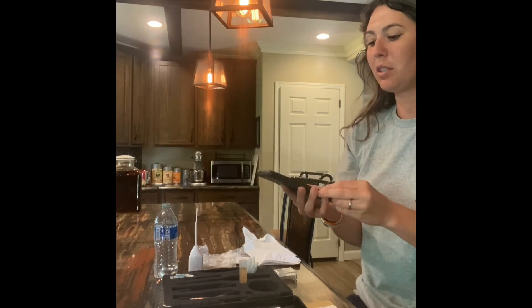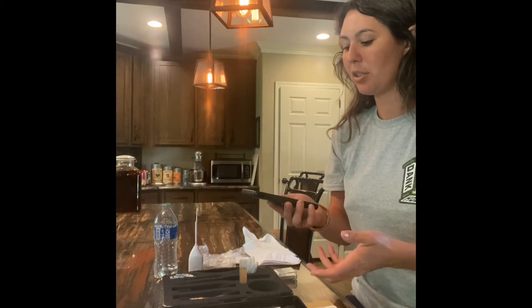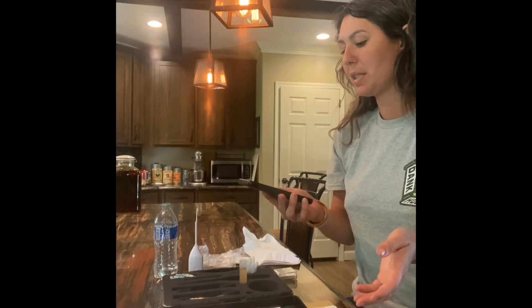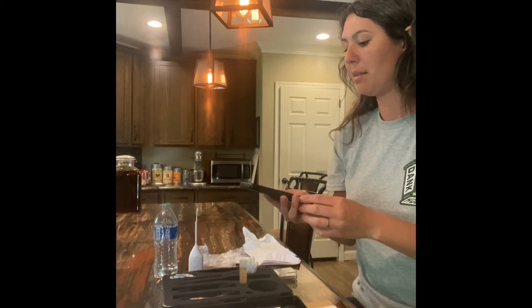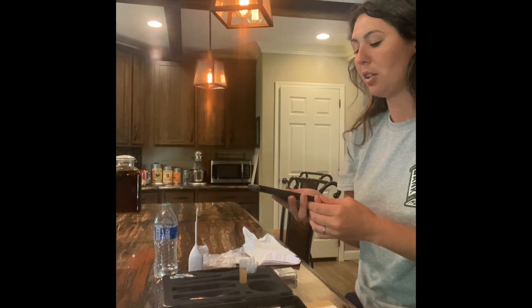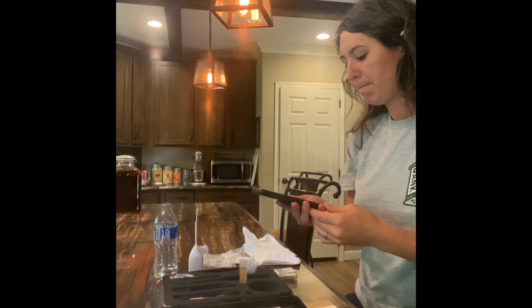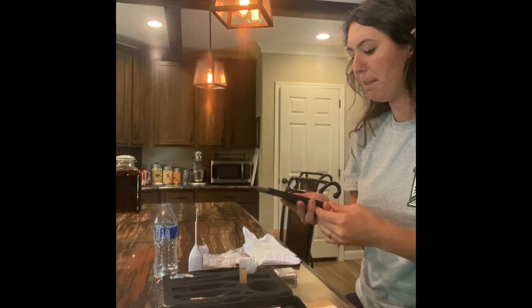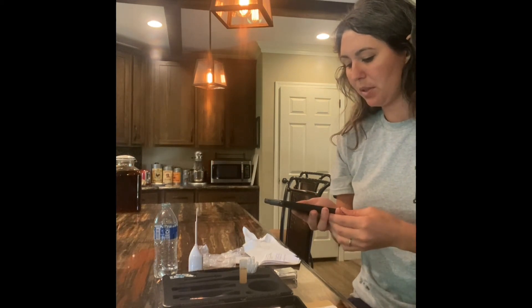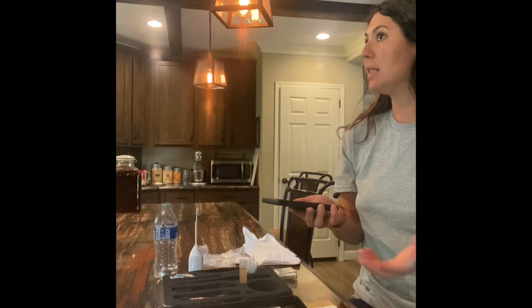This is very useful — you can tell the content of your microbes and their ratio in the soil. It also gives you the fungal to bacterial ratio: 34% fungal and 66% bacterial. This is an area that's been tilled, which is probably why the fungal ratio is much lower. Microbiometer — my first time using one. I'm excited to look at these results in further detail and then sample the same area in maybe six months to see how it's improved.